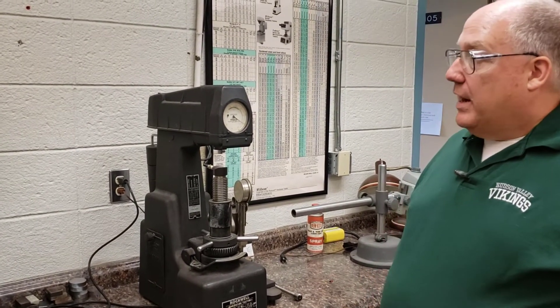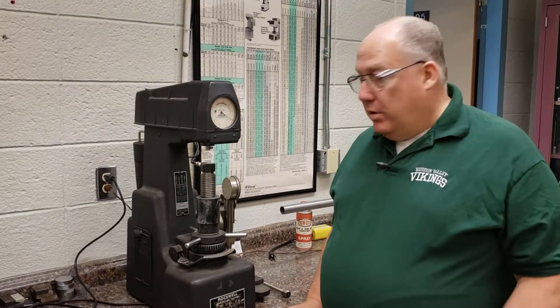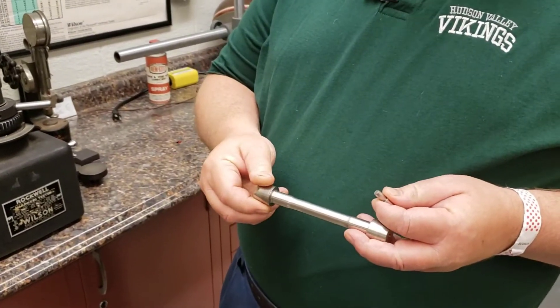In the video on the electric Rockwell, we did a flat specimen. Now I want to show you how to do a round specimen. I'm going to test this piece of 316 steel for hardness.